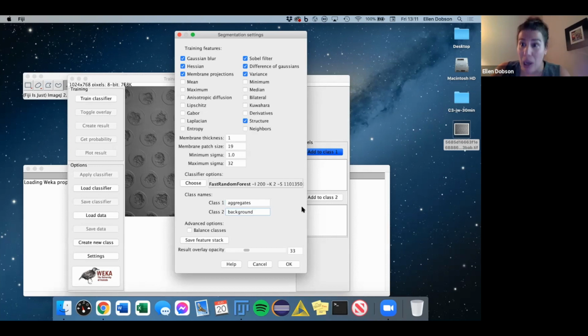Now, in some of your cases, maybe you open this up and you see some of your features are grayed out. That's because you need to enable that update site called Image Science. So if you go back and you're updating ImageJ, go to the Manage Update Sites and enable that Image Science, then you'll get access to all of the features.